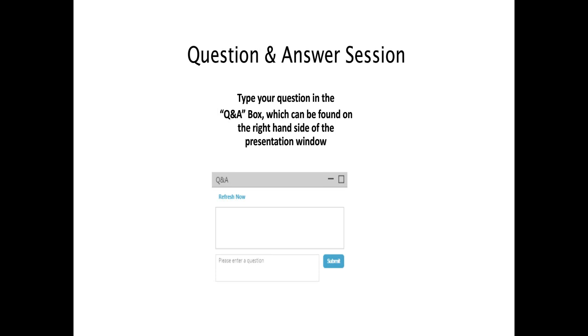Again, going through the scouting process, looking at different pHs, we saw that will influence the elution order and behavior of the different types of analytes. So again, it comes down to the goal of the chromatographer. What would they like to see? Would it be the acid eluting first, or the neutral, or the basic compound? So yes, it is possible.